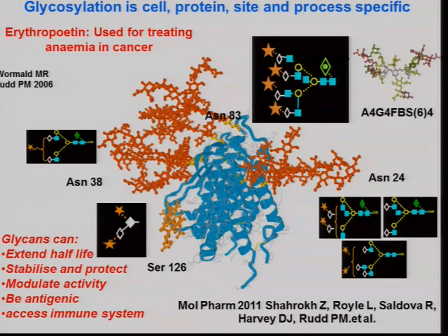Whereas if they have LC, they can have it in the production lab, and they can just run their sample straight away. So most companies, I would say, are using 2AB labelled normal phase and HILIC separations as their bog standard way of doing it. But companies also use mass spectrometry. They will use it as well. Some companies use primarily mass spectrometry, although they're getting less.